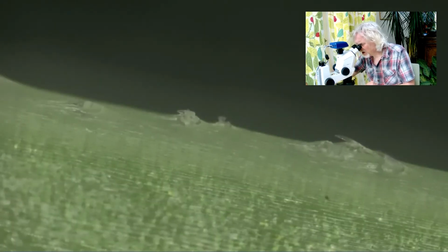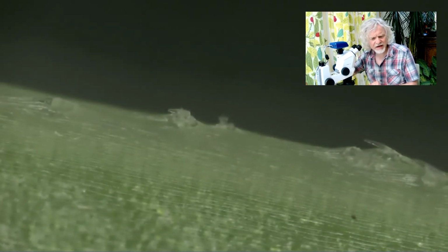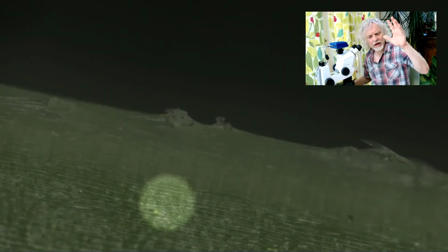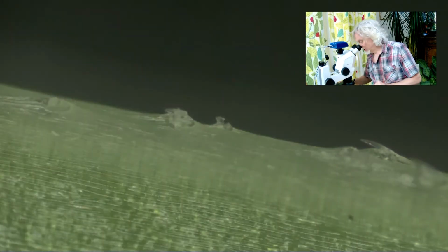Let's get this in. This is quite difficult to manoeuvre. And I think part of the problem is the hooks get bashed off. And now I am zoomed in quite a long way. This is 50 times magnification. You can start to see individual cells. So all of this, you see down here, you've got this sort of lumpy, bumpy, rippled effect. These are actually individual cells that you're looking at here. And here, there's one of our little hooks. And if I turn off that light, maybe, and turn up the backlight, oops, turned off the backlight, and turn that up, you can see the hook sort of shining up nicely. And you can see they really are very, very sharp.